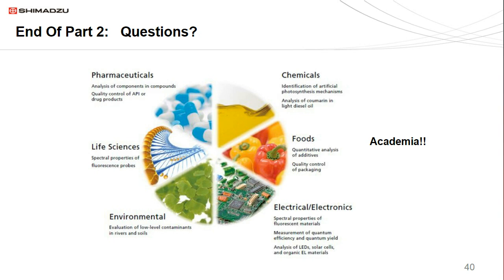Thank you. The next question is, what method is better for mixtures, 3D matrix or synchronous scan?